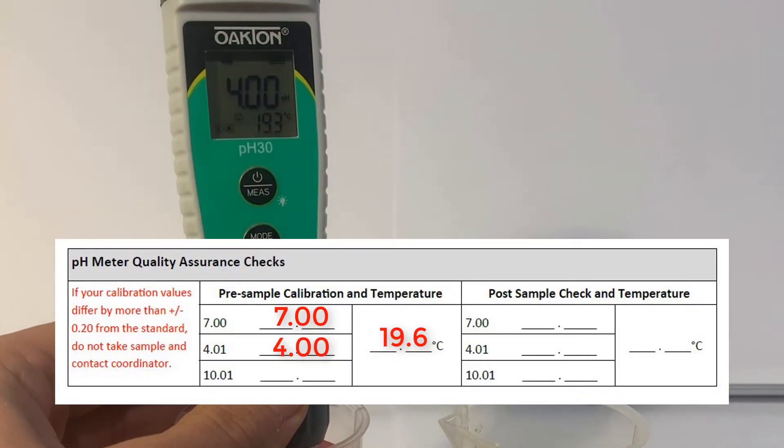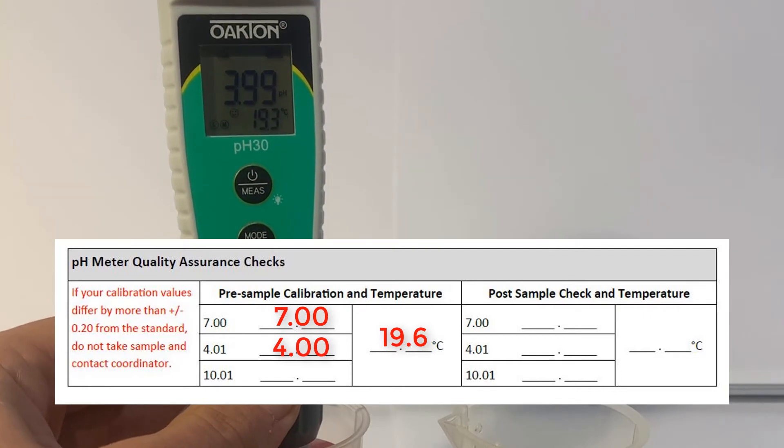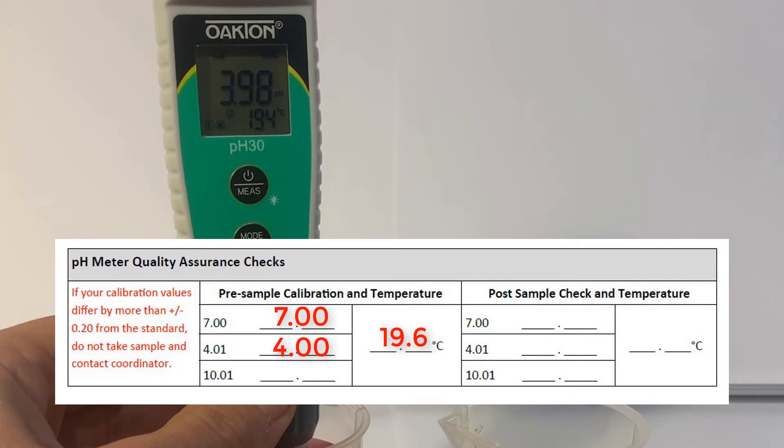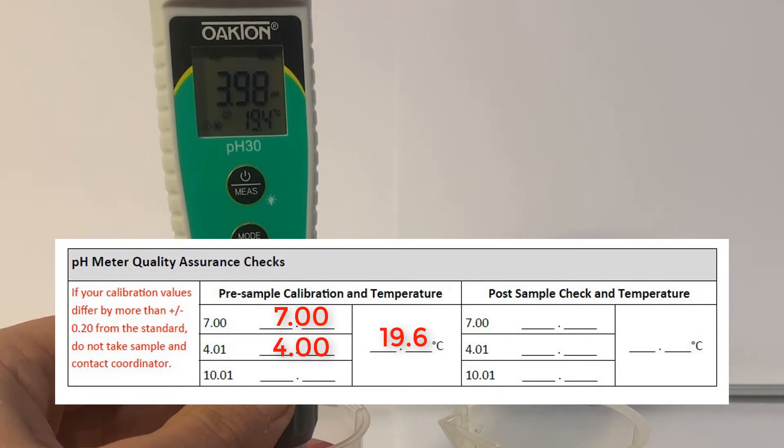If you used Buffer 4 and 7 solution, you will see an L and M icon for low and middle in the lower left corner of your screen. If you use 7 and 10, you will see an M and H for middle and high.